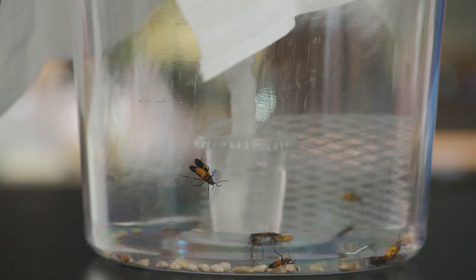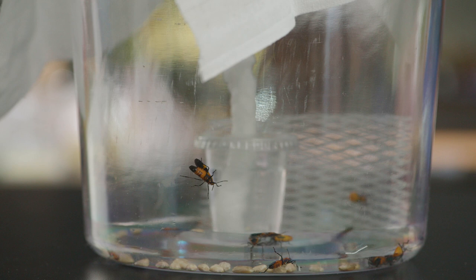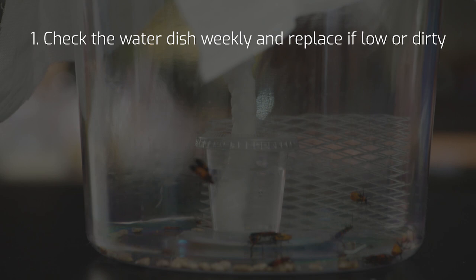Number one, check the water dish weekly and replace if low or dirty. Number two, remove any moldy, dirty, or shrunken sunflower seeds and replace them with fresh sunflower seeds.